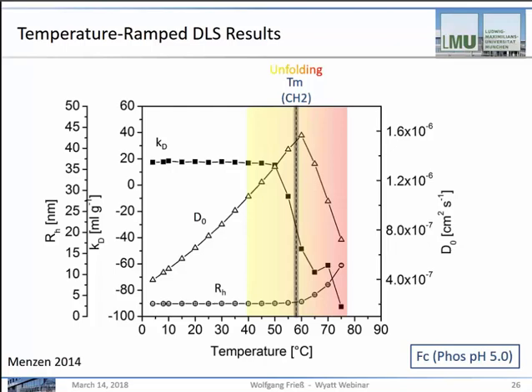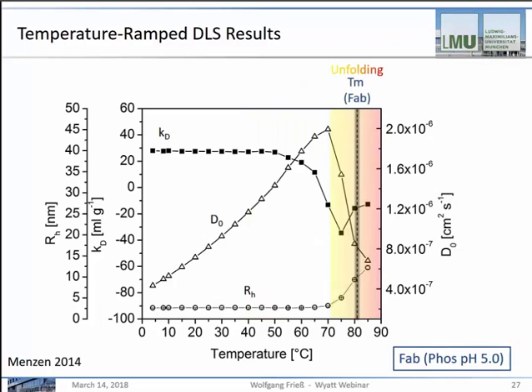So we go into the unfolding and we see the substantial formation of attractive interaction, and this becomes even more pronounced at the higher temperatures, stronger interactions, although we don't see the formation of these large visible aggregates, but we certainly have the formation of larger clusters, just based on the Fc part. The part which was much more prone for aggregation was the Fab part.